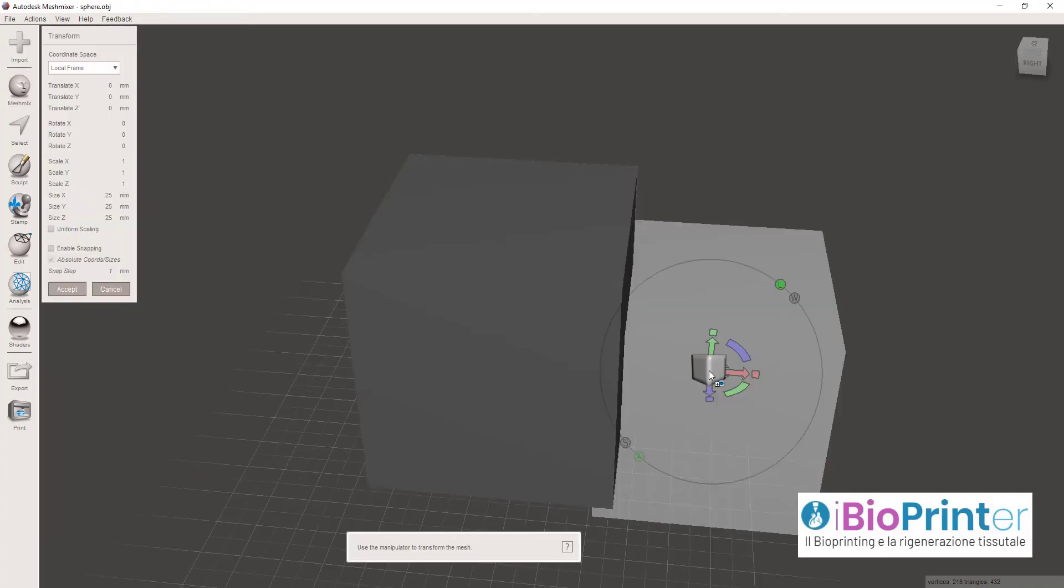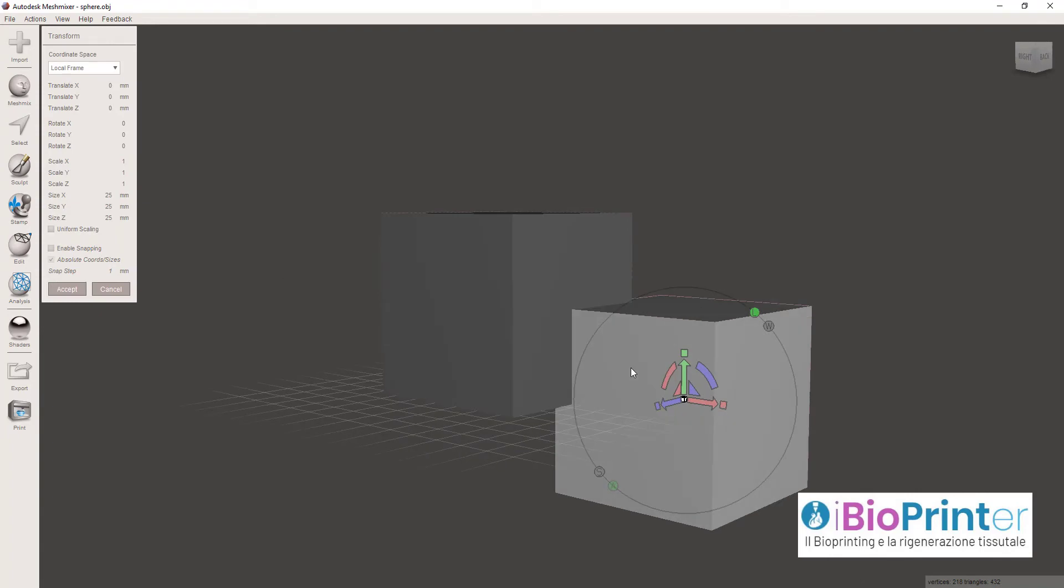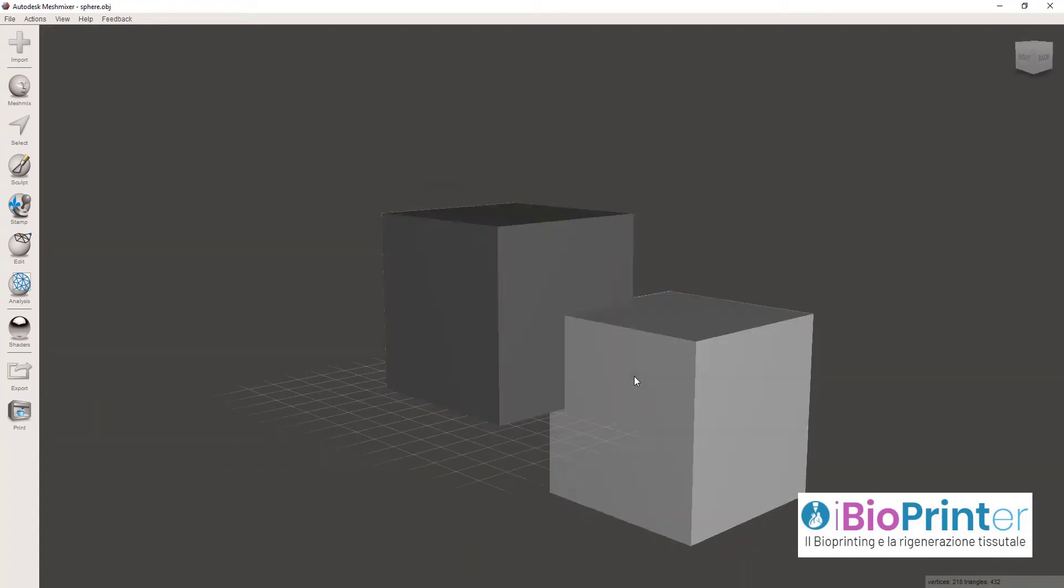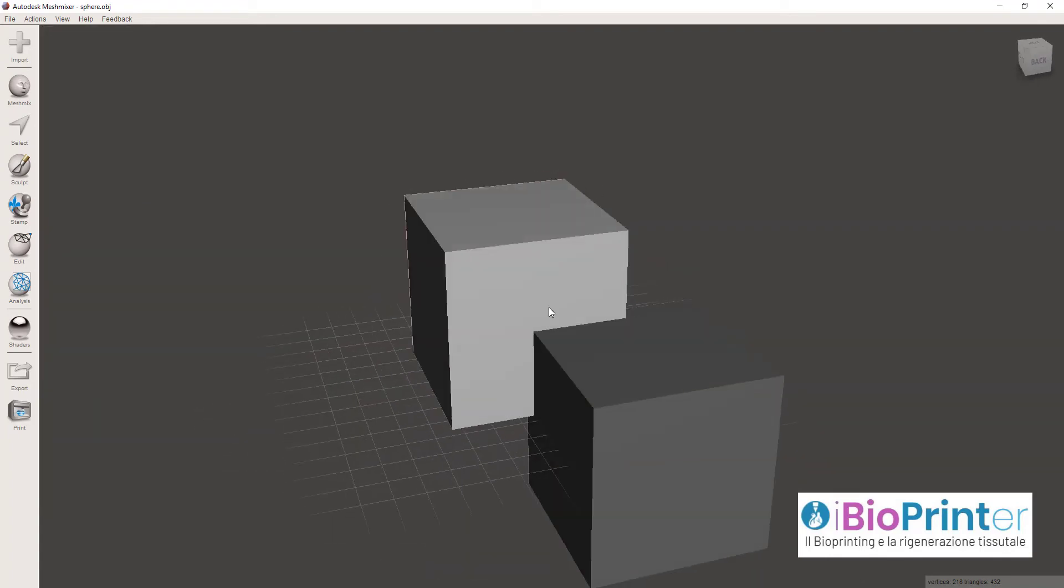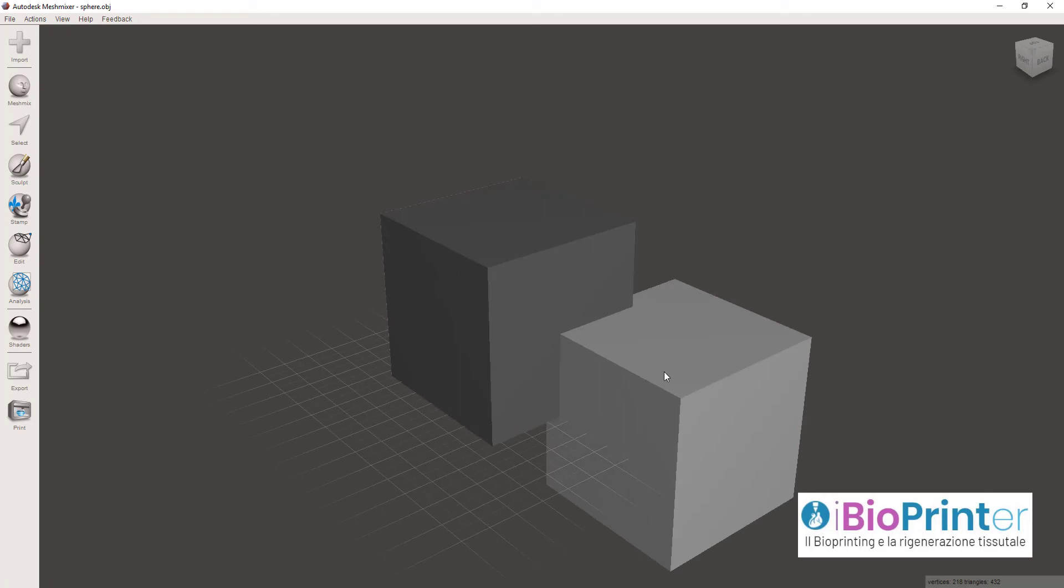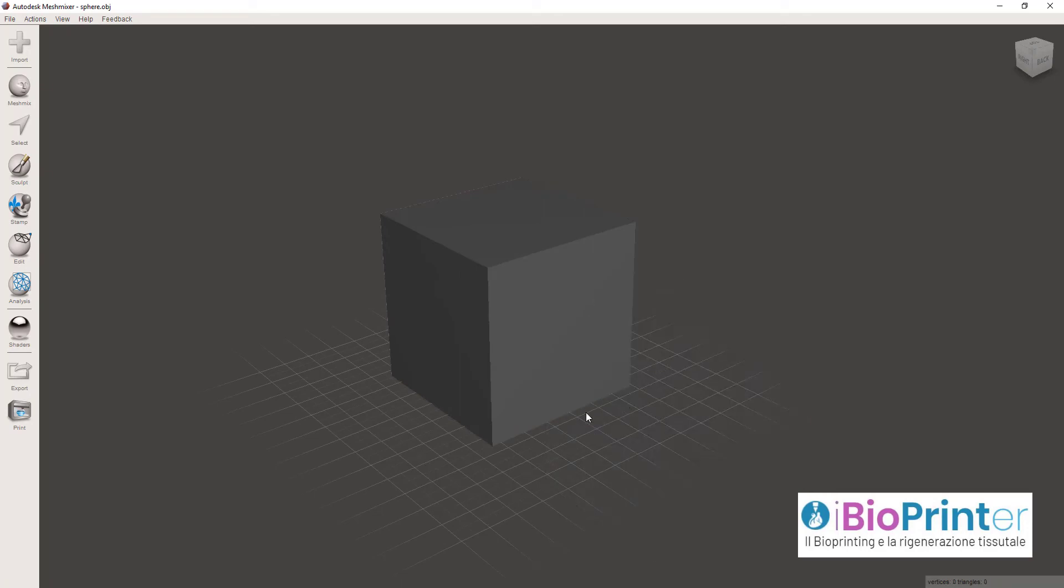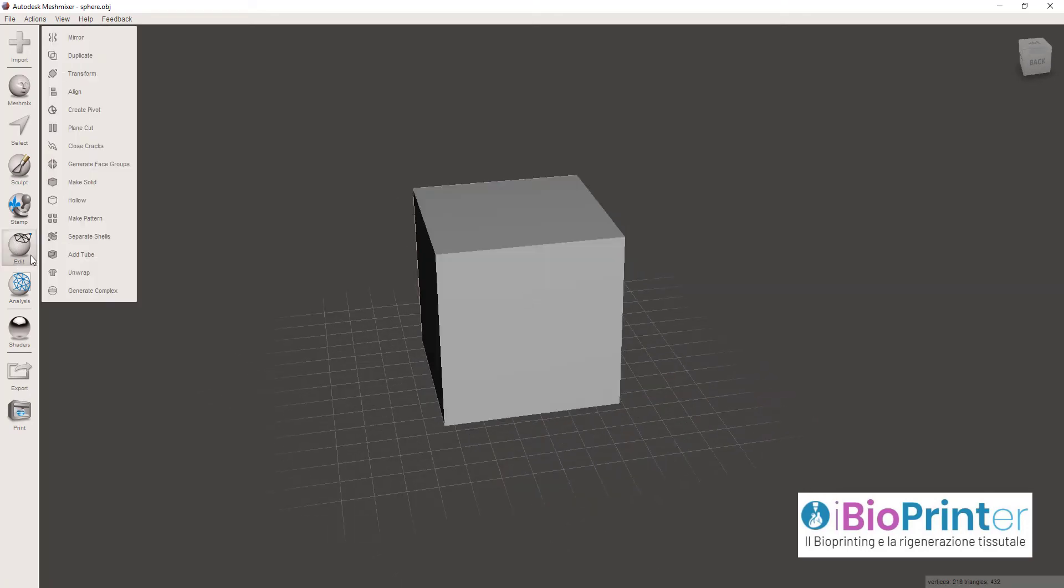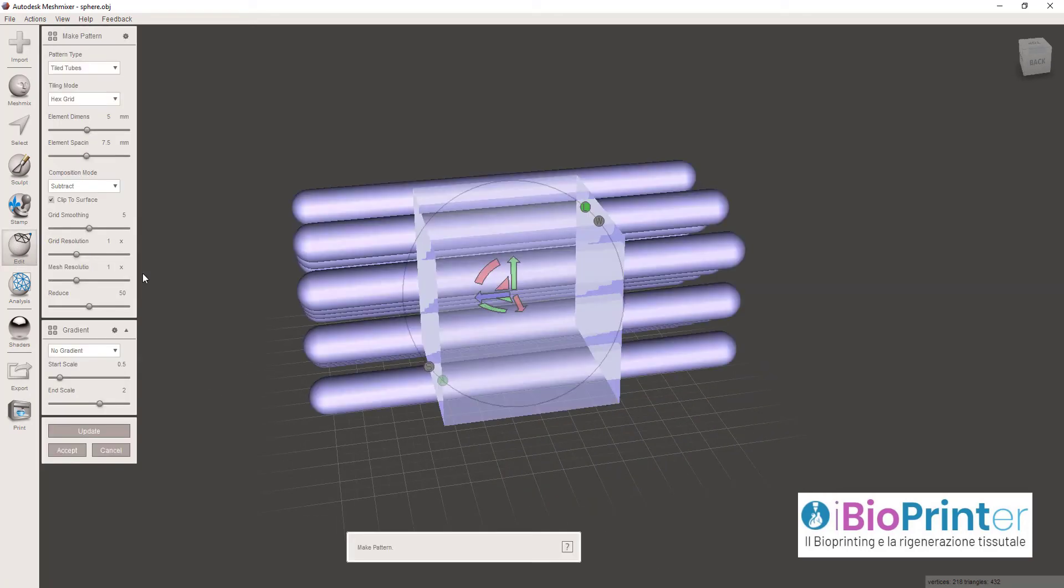Scegliendone una, vedete un cubo, potete trasportarlo sull'area di lavoro. E andando a cliccare su Edit, Make Pattern, questo cubo può diventare una struttura tridimensionale di varia geometria.